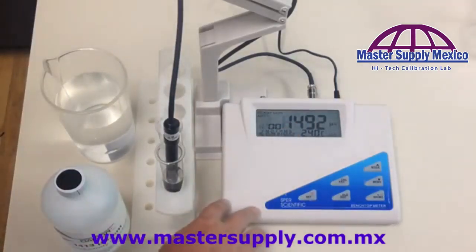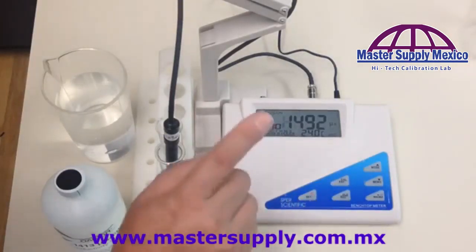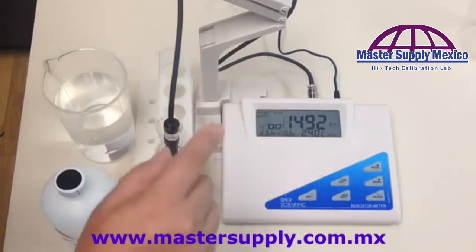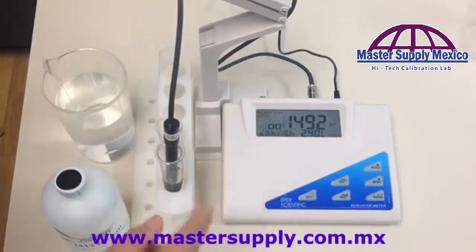One important note: any time you calibrate the unit, since it has five different ranges, you are only calibrating one of those ranges. When it resets, it only resets that one range — it does not reset all five ranges. All this information is found in your manual, starting on page 31 for conductivity. Thank you.